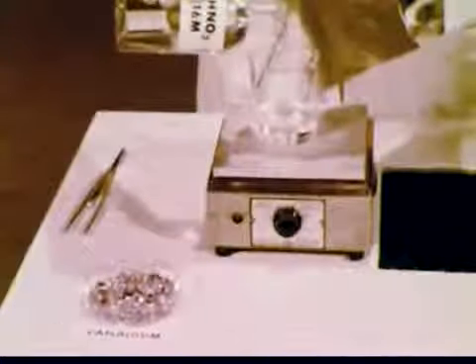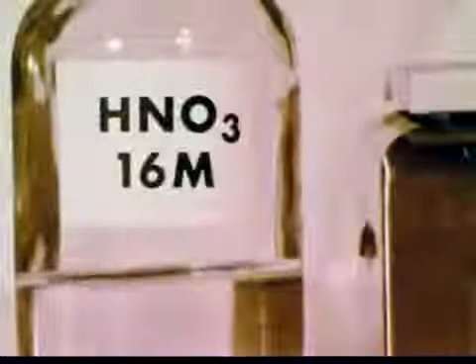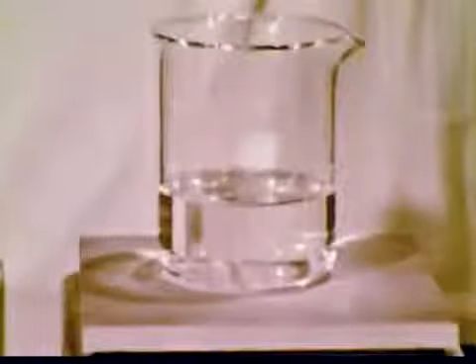Like most metals, vanadium reacts with many oxidizing agents. Nitric acid is an especially strong one. The nitric acid is heated on this plate to increase the rate of reaction.